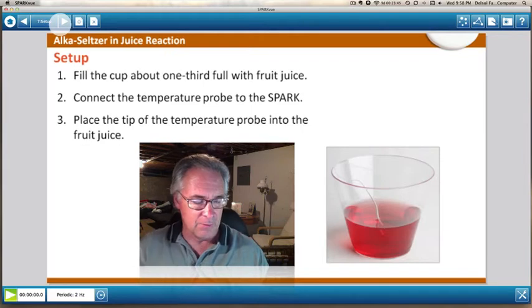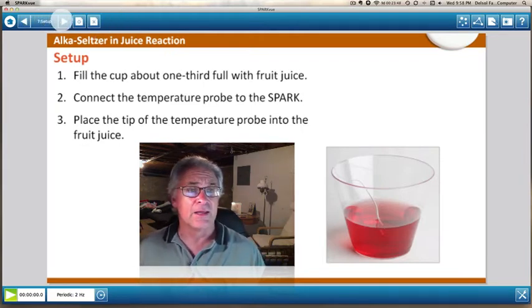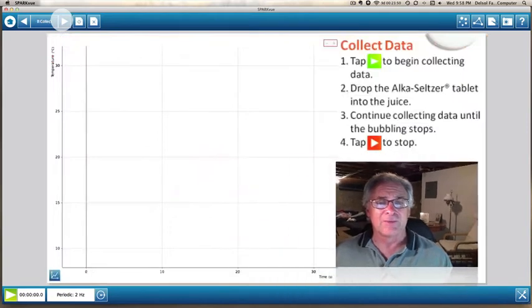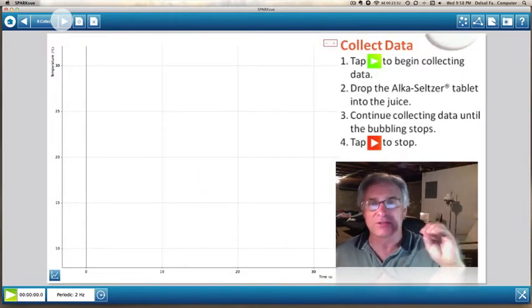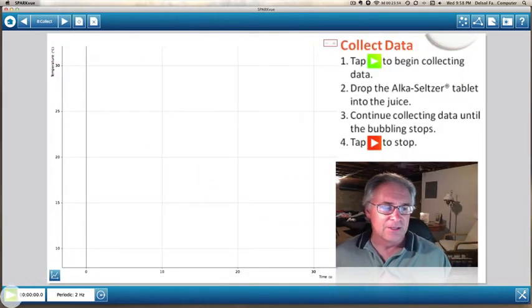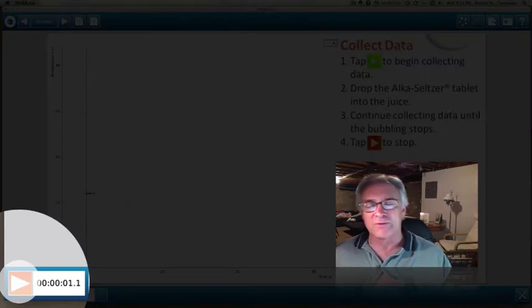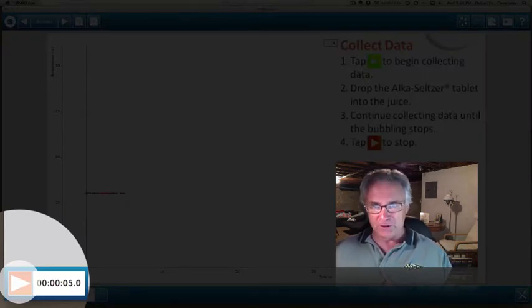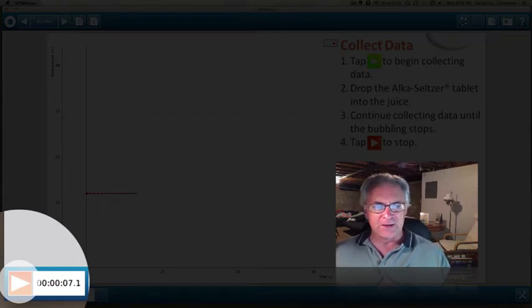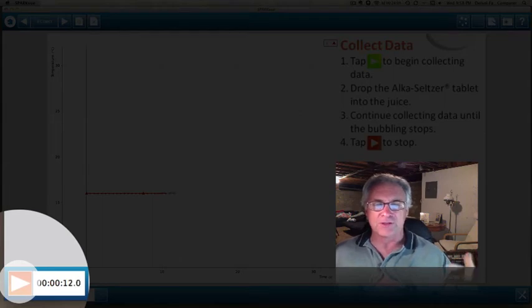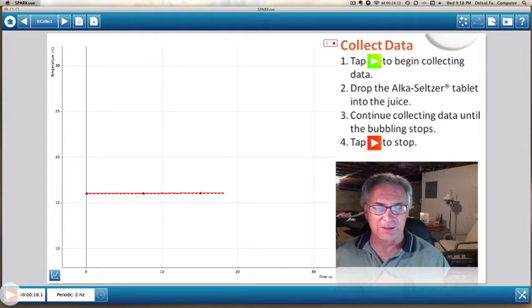All right. Now what we're going to do is I'm going to take a temperature reading. But I want to take the temperature reading without the Alka-Seltzer first because I have to give a baseline. So I'm going to let it run between 15 to 20 seconds so that we get a good baseline. Now understand that there's a clock right down the start button. And you can see approximately how many seconds have been going on. So I'm going to drop this in right at 20. I've got a good baseline number.